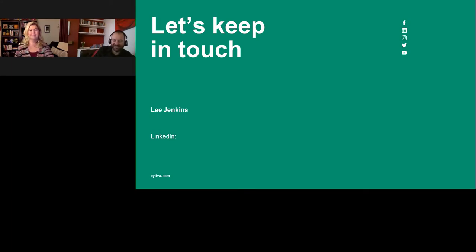So before I answer this, I guess the best answer for today is there's a session later in the summit about scaling up your development. So we've got Aberdeen Health talking about the importance of a contract manufacturing organization and talking to them early in your development. So join John's session later today to understand exactly what's involved there. We also have Biodot coming on at the end of the event to talk about how they can bring scale to the test. But from our side as a component supplier, we suggest that you choose materials from high quality suppliers with appropriate levels of technical support.